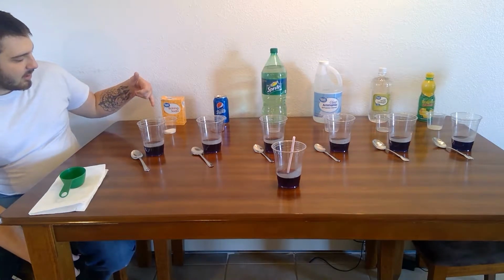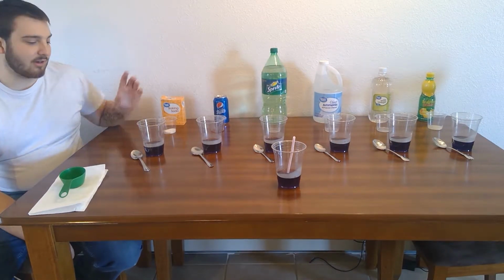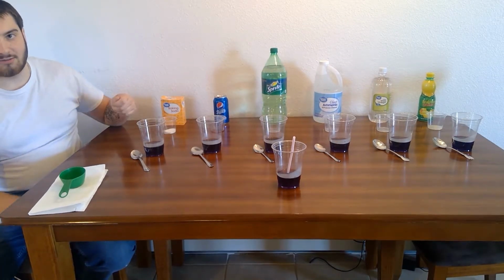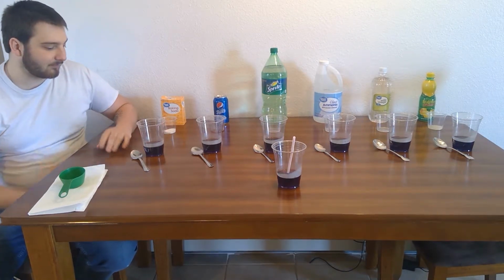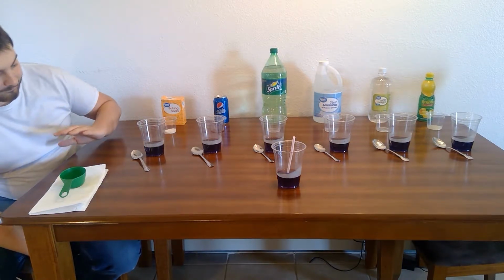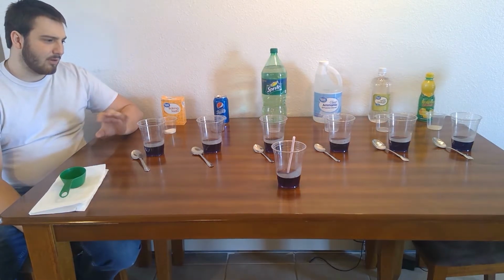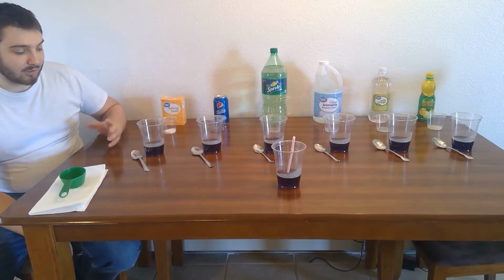In front of it, we have the teaspoon already measured out, so that'll be a quick, easy add-in. Right now, none of this has been messed with. They're all a really dark purple, so we're going to see how that changes.